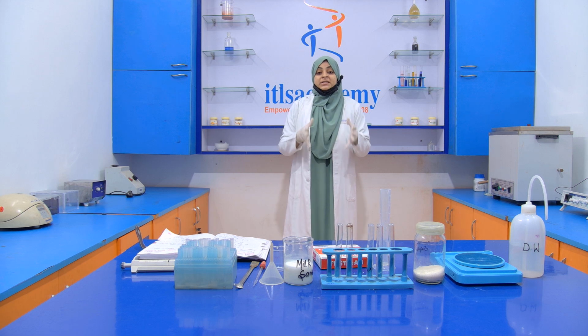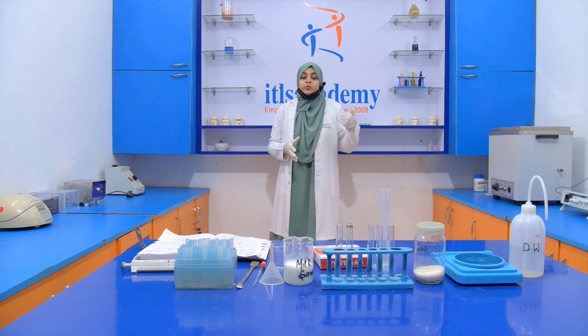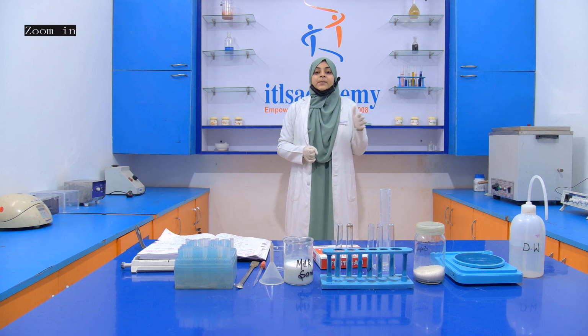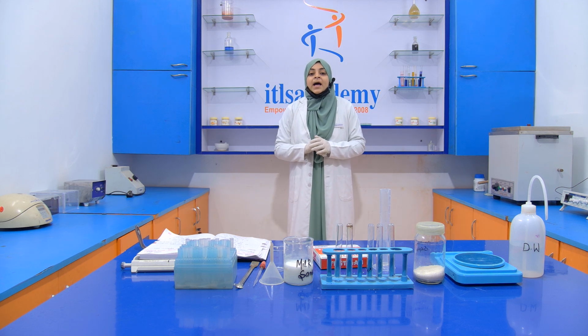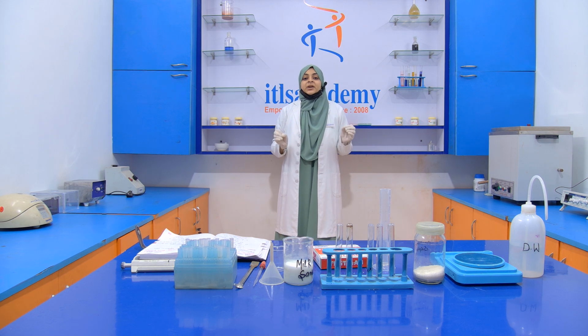Sterilization is when we give heat to the product, and with that amount of heat all types of microorganisms are killed, destroyed, eliminated. Then it is called sterilization.